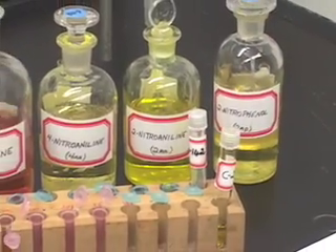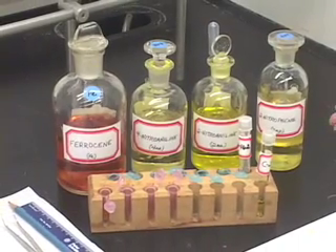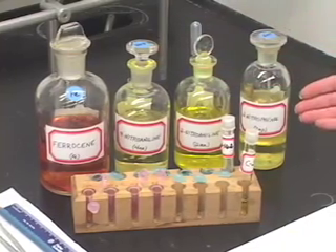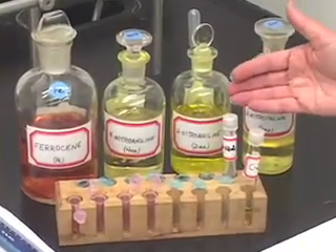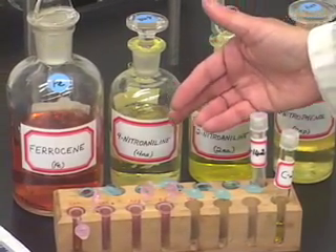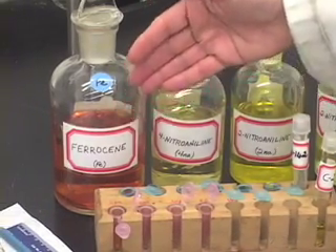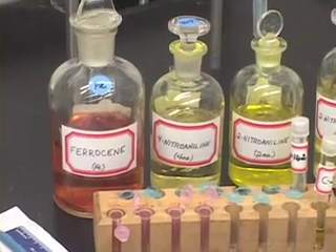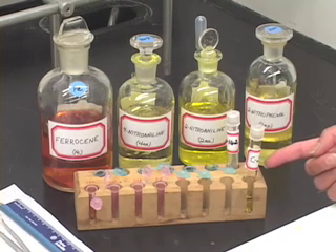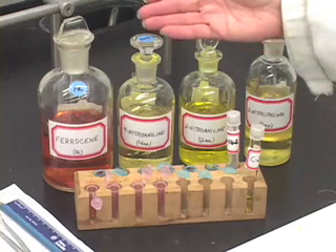Let us see what things we need for this experiment. First of all, we need all the standard compounds: nitrophenol, 2-nitroaniline, 4-nitroaniline, and ferrocene. These are the four standards that are possibly present in your colored unknown, so we need to have these four standard compounds.